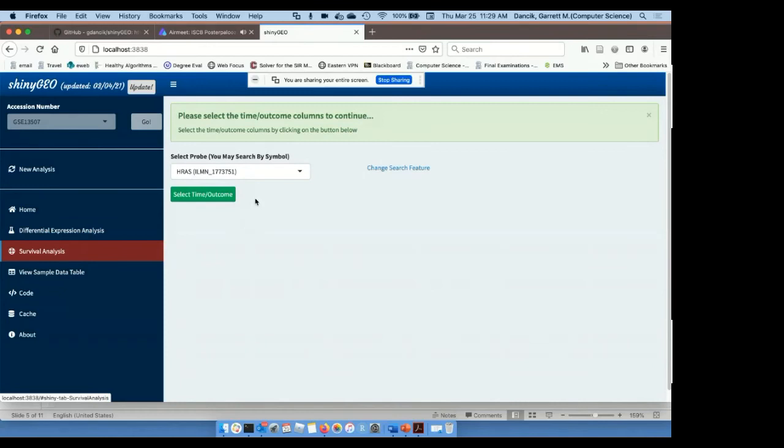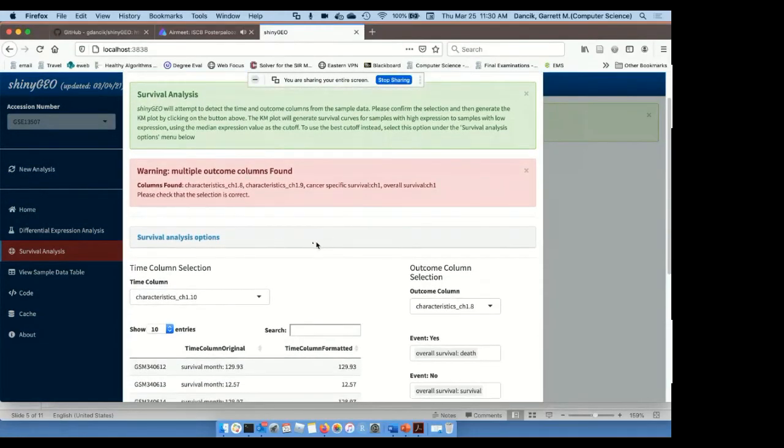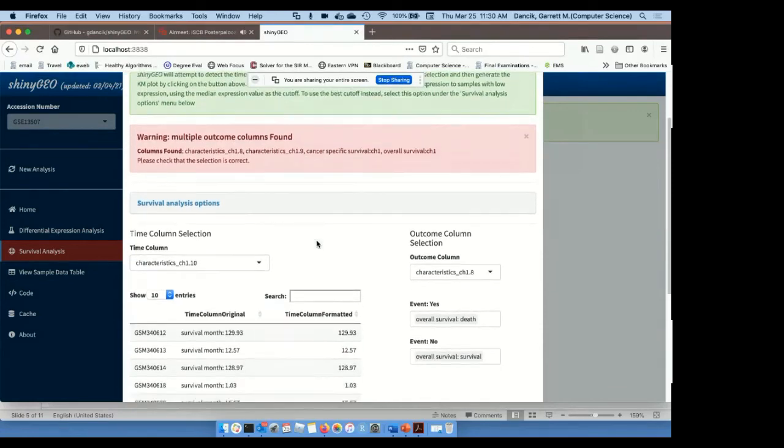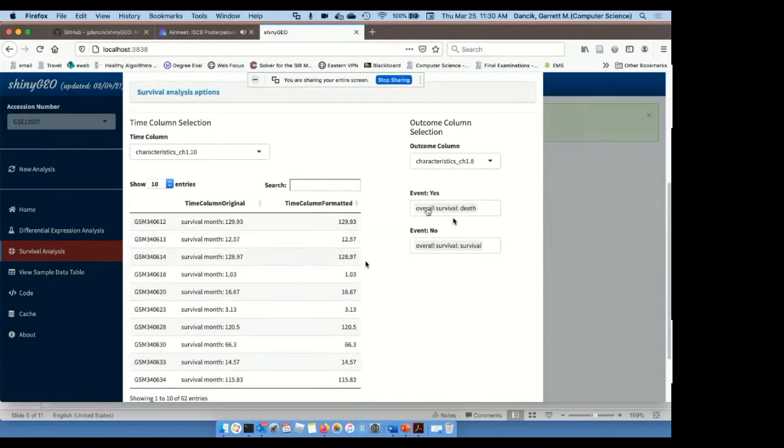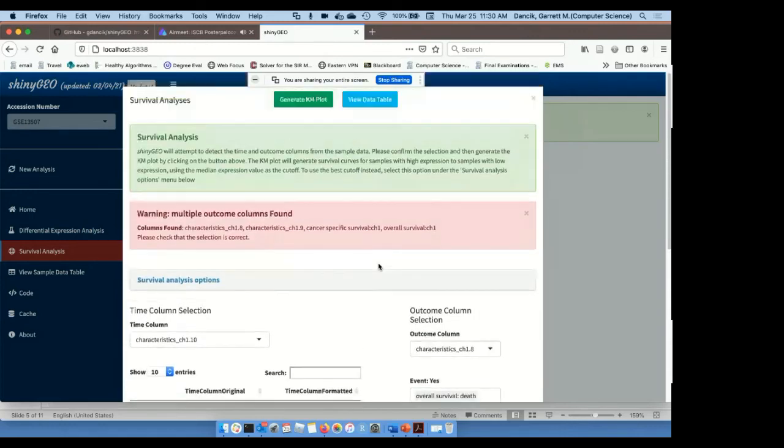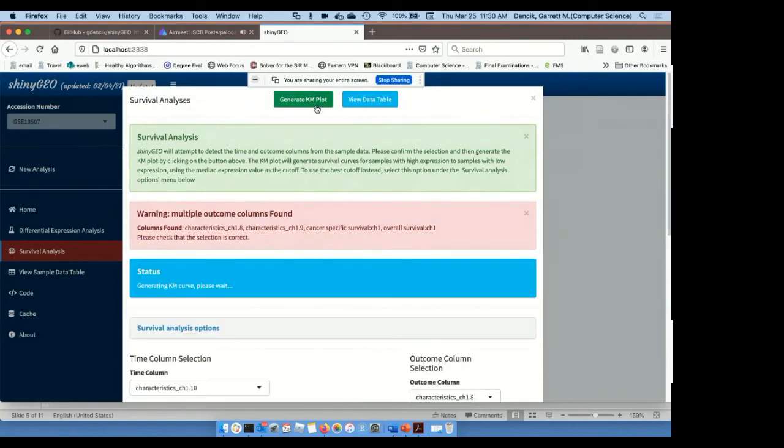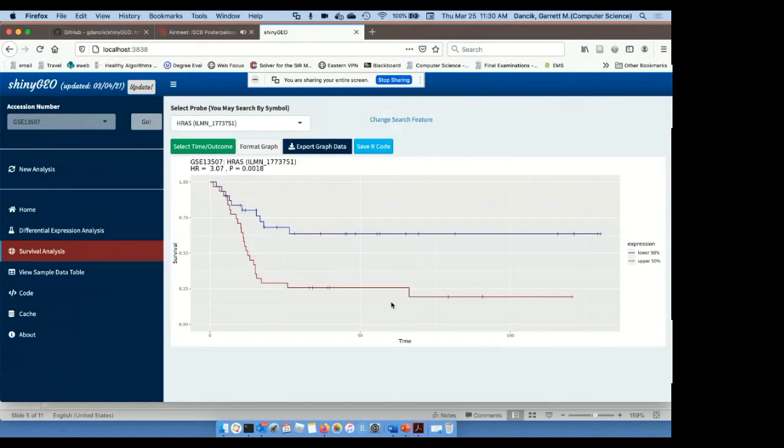I then go to survival analysis, select the gene, which is already selected, and then need to select the time and outcome columns that have the time to event information as well as the event information. ShinyGeo will try to auto detect the columns and identify the columns that contain the relevant information. And in this case, it does that correctly. This specific column 1.8 contains the event. The yes event is death. In this case, the non event is survival. And then the time column is also detected correctly, and is also formatted to just be converted to a numeric value. When I'm happy with that, I can click generate Kaplan-Meier plot. And that will generate the Kaplan-Meier curve.